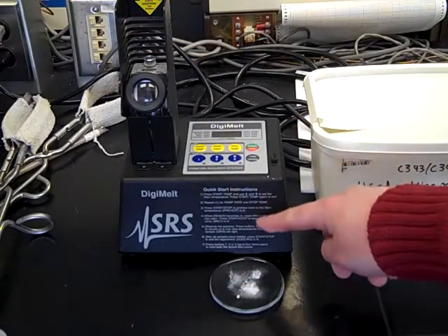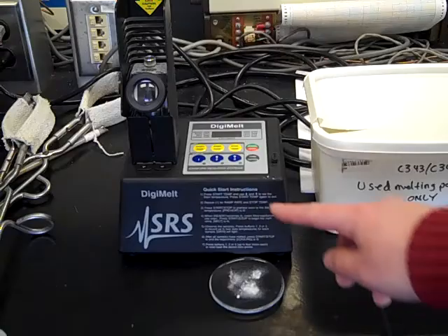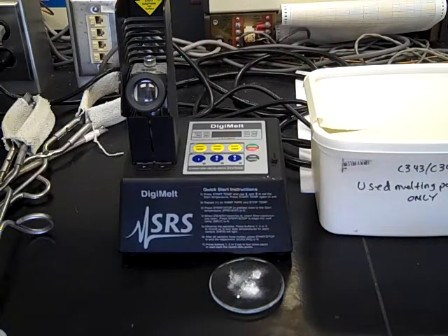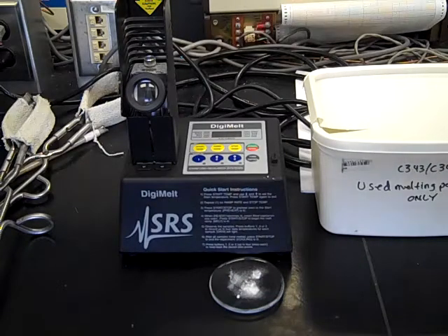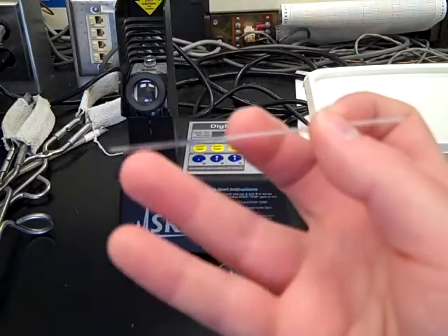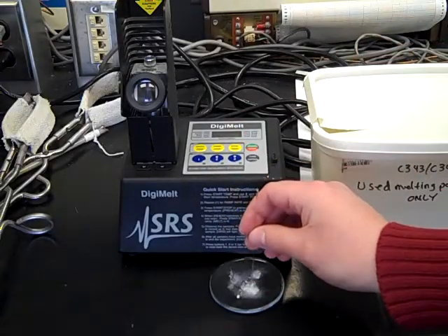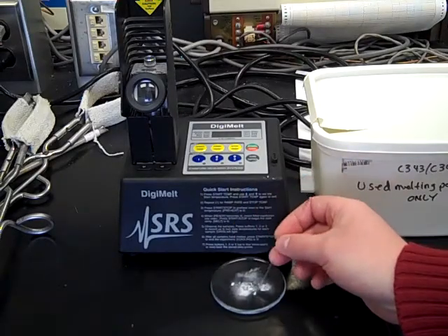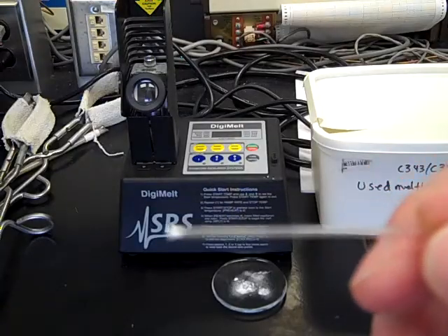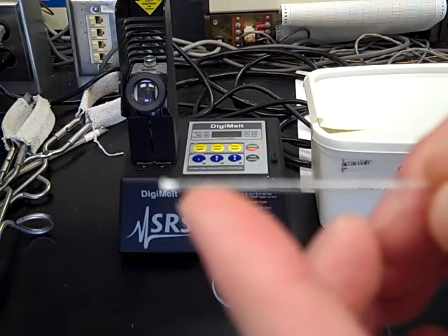All the operating instructions are clearly listed on the front of the machine, so I'll briefly walk through those steps, but if you ever forget, just review the procedural steps listed there. The first thing to do is fill a melting point capillary with your solid. Here's the melting point capillary — closed on one end, open on the other. Take that open end and dab it into your solid on the watch glass. You should end up with solid filling just barely a little bit of the tip of that capillary.